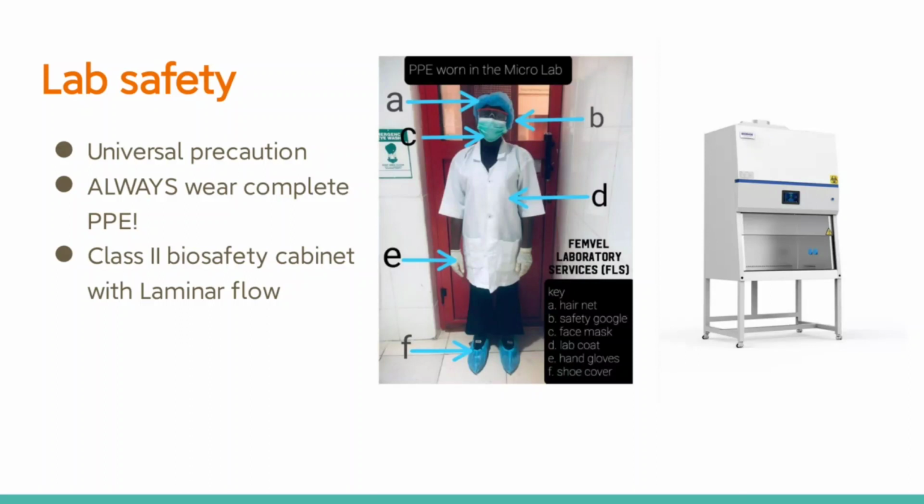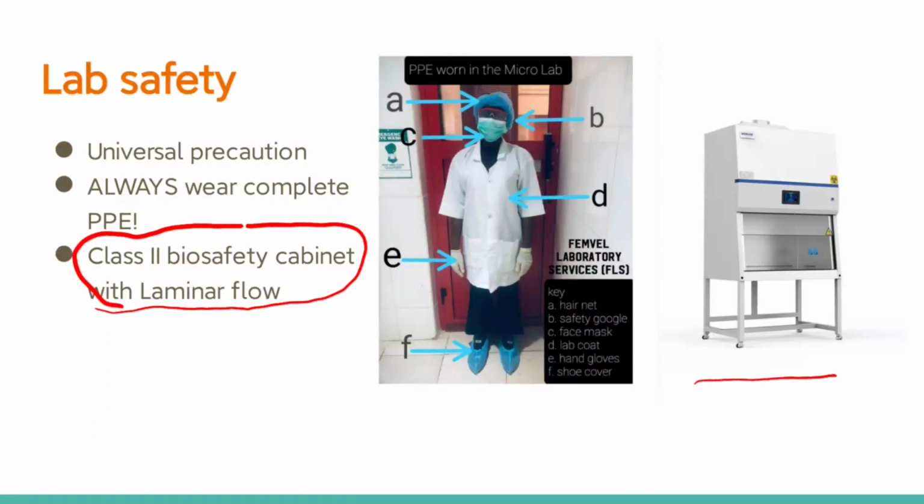So first and foremost, you need to remember lab safety when handling fungal specimens. Of course, we have what we call the universal precaution, meaning you treat all specimens as infectious. Okay? And you need to always wear complete PPE. And then this one's important. Here, you only use a class 2 biosafety cabinet with laminar flow. So this is what it looks like, no? Class 2 biosafety cabinet with laminar flow.